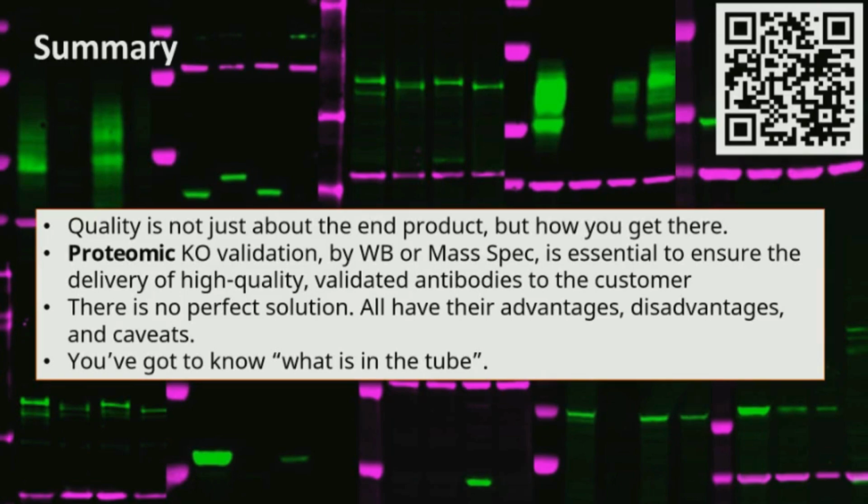When you're buying in cell lines, you've got to have them proteomically knockout validated if you're going to put them into your pipeline or use them in your experiment. Otherwise, you're going to fail them and waste a lot of time. There is no perfect solution. I think we all know that. You've got to mix stuff up. Sometimes you might do Western blots, sometimes mass spec. You're going to use application validation, positive cell lines, and negative cell lines. And thanks to all the comments around phosphomarks being hell, thank you everybody for commenting on that. That's what you've got to do to know that you're getting the right antibody and it works in your assay. Just remember, you've got to know what is in your tube.